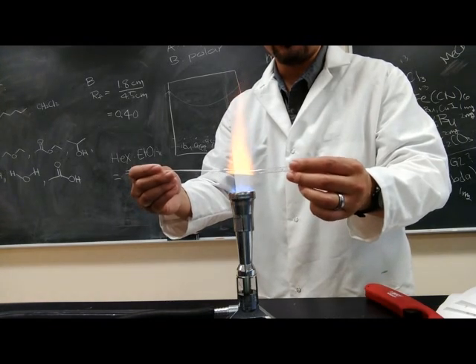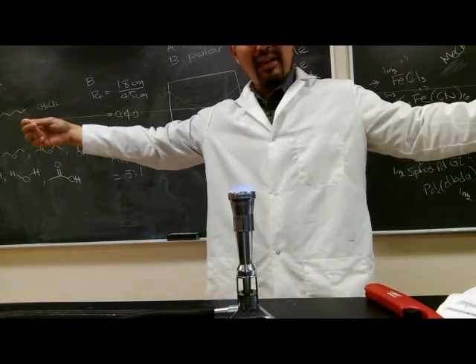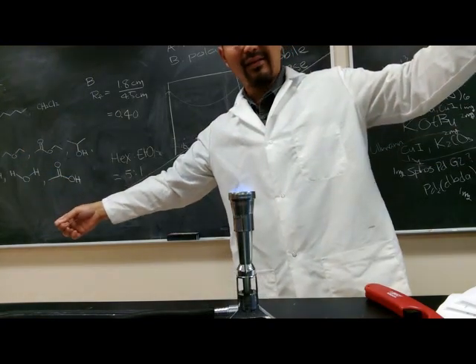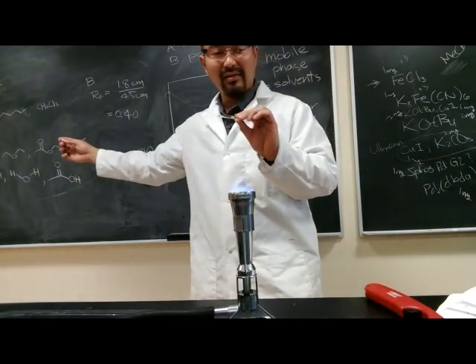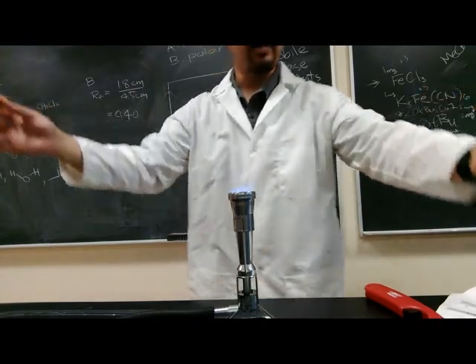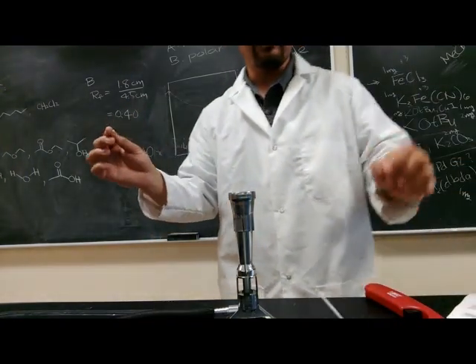You can only go by the feeling, but it's going to feel really soft. Then you want to pull the pipette out of the flame first, and then pull it really fast. Now be careful, because this glass is still hot from the flame. You can set this down on the black bench top, but otherwise do not touch it. That's how you can get burned doing this.